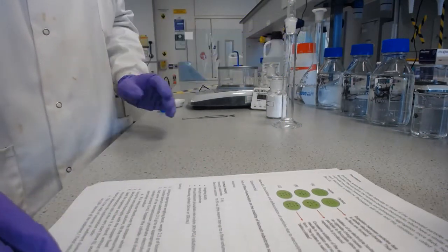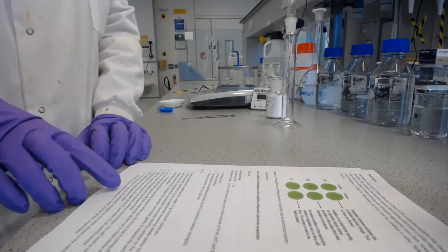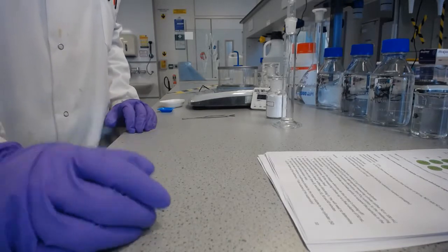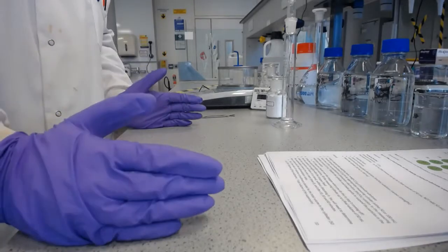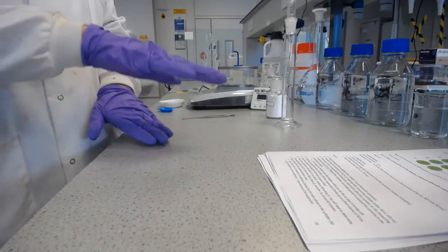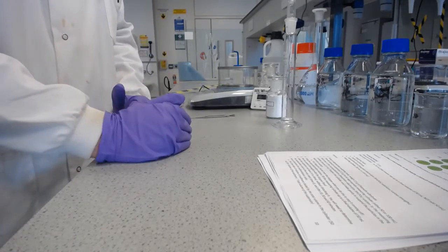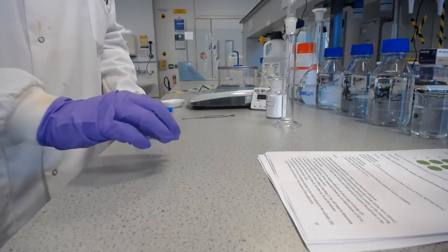And the sedimentation ratio, you can see, is defined at the bottom here in your script. So this is the ratio of volume of sediment divided by the total volume in the cylinder. So if you had no sedimentation, your total volume of sediment would be the full amount, essentially, because you'd have it all the way up the cylinder. Whereas if, say, for example, it's gone halfway down, you see a gap where you've got sedimentation halfway down the cylinder and the other half is clear liquid. That would be 25 millilitres divided by 50 millilitres, which would give you a sedimentation ratio of 0.5.